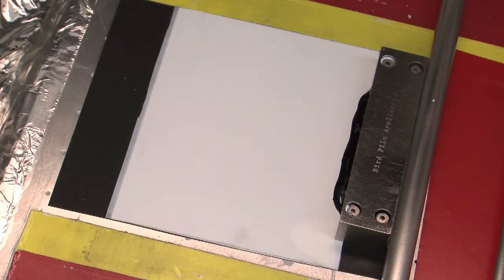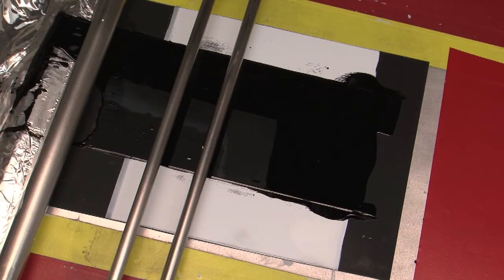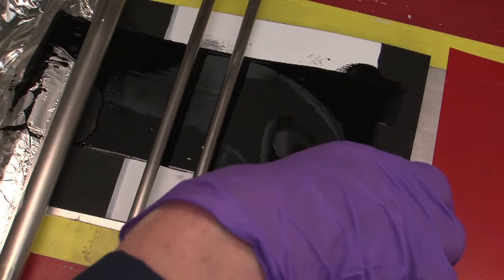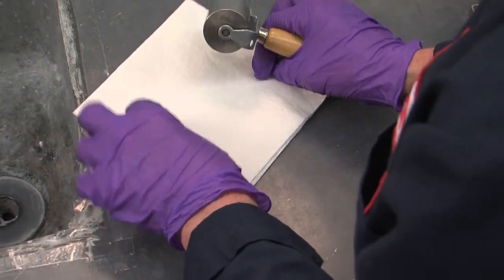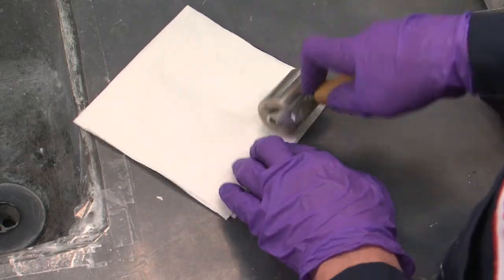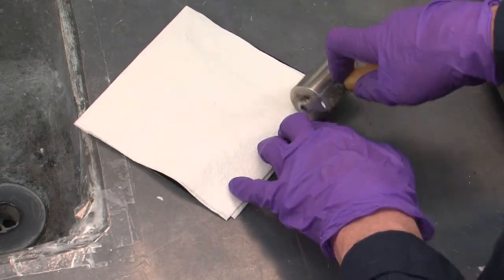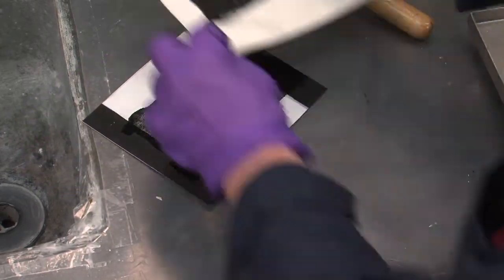Now we use our automatic drawdown machine to apply a soilant to the polyester panel. A roller and towel are used to remove excess soilant. The panel is then left to dry for 16 to 24 hours.